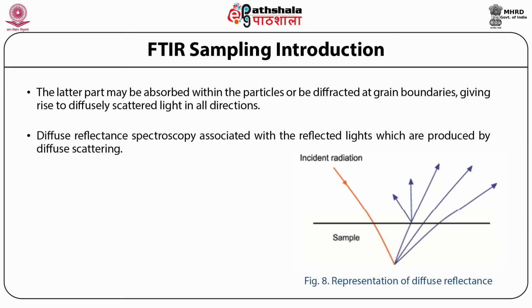So, diffuse reflectance spectroscopy is associated with the reflected light produced by diffuse scattering as depicted in this figure.